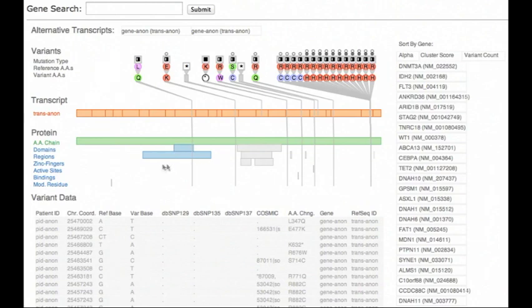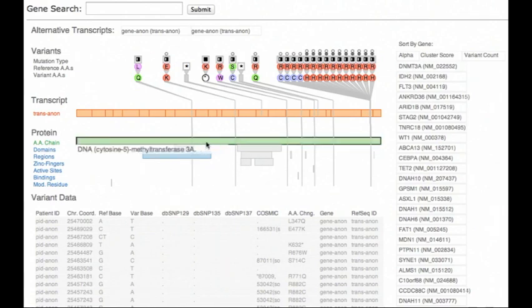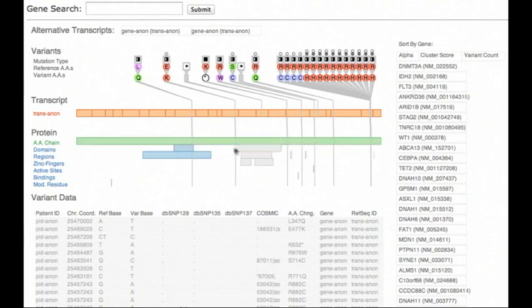Ranges within protein regions intersected with variants are blue. All other regions are desaturated gray. Mousing over protein regions pops up a dialog with more information.